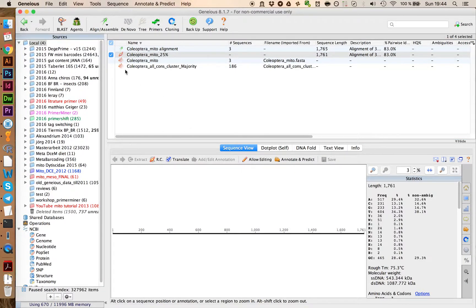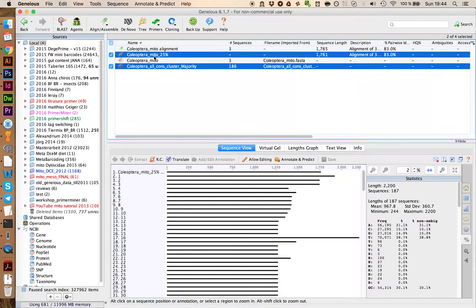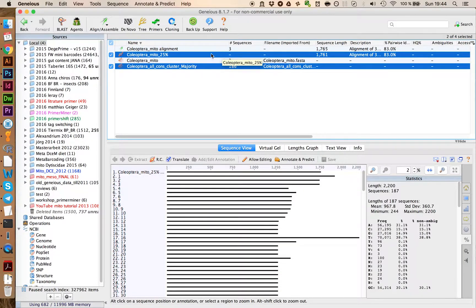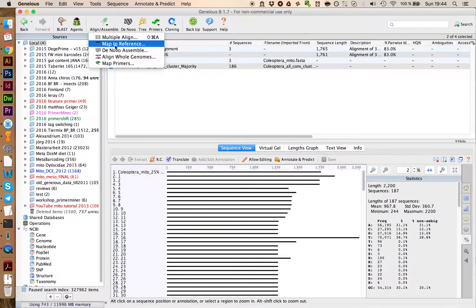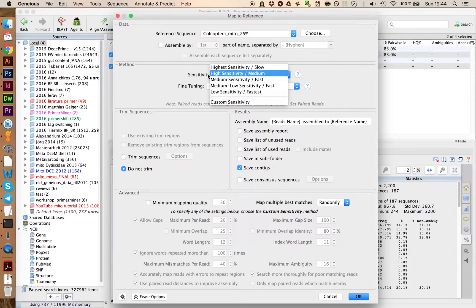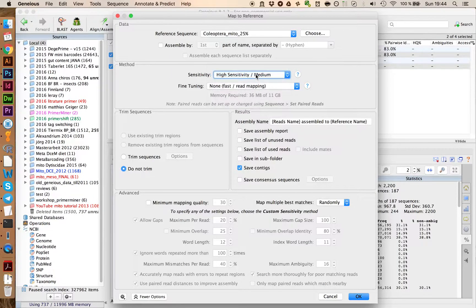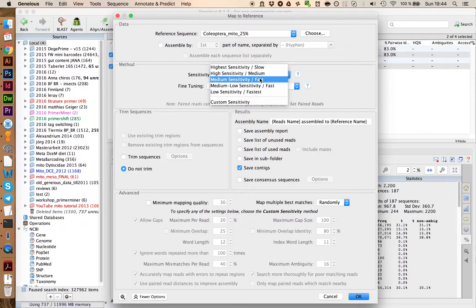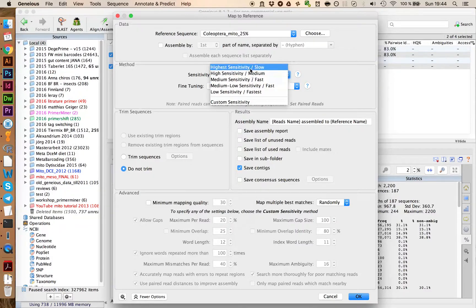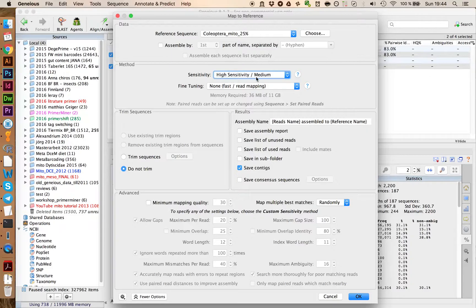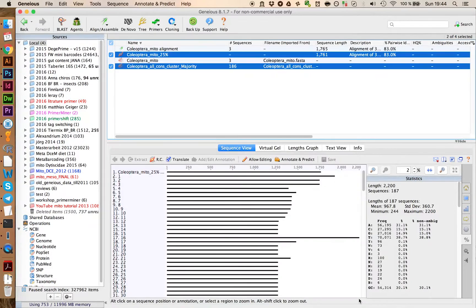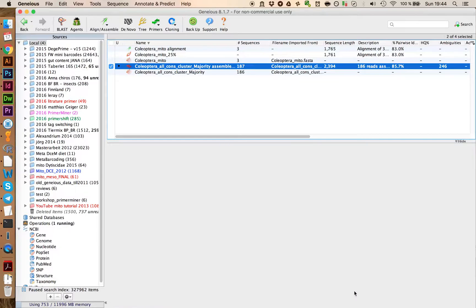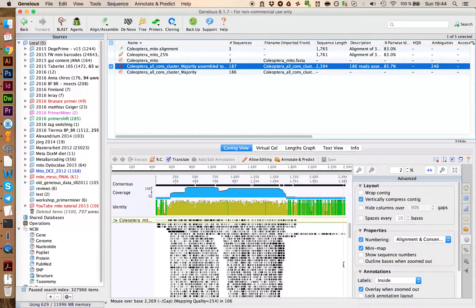We can next go ahead and map our reads against this consensus sequence here. We do this by going to Map to Reference, and then here you want to select High Sensitivity Medium. For very large datasets, you could even go on Medium Sensitivity. If you go on High Sensitivity, it takes way too long. So usually this is fine. We can click on OK, and we will map the reads to the reference sequence.